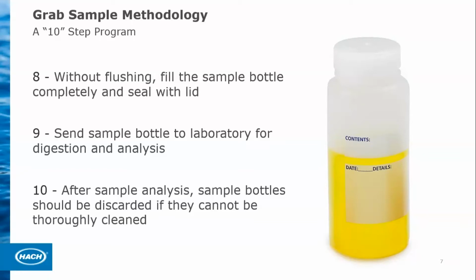So again, when should that sample be analyzed? Well, as soon as possible. But normally, once you do collect the proper sample, it's going to be okay for a while, but you don't want to delay too long, so that if there is any significant corrosion product, it's not settling out. And then normally dispose of the bottle or make sure that it's cleaned properly before you go to reuse it.